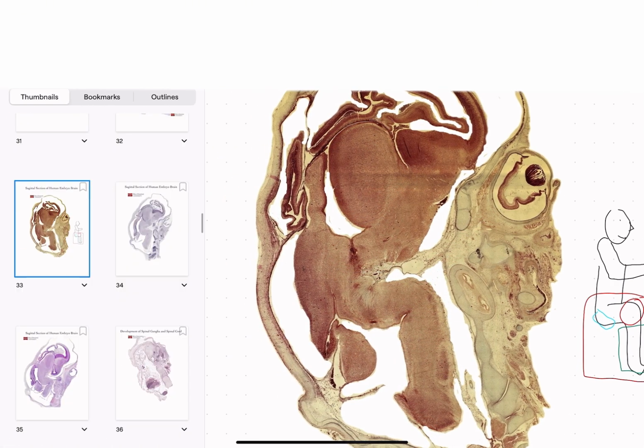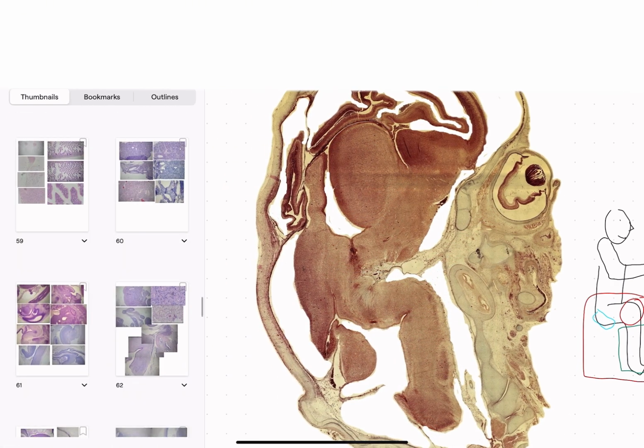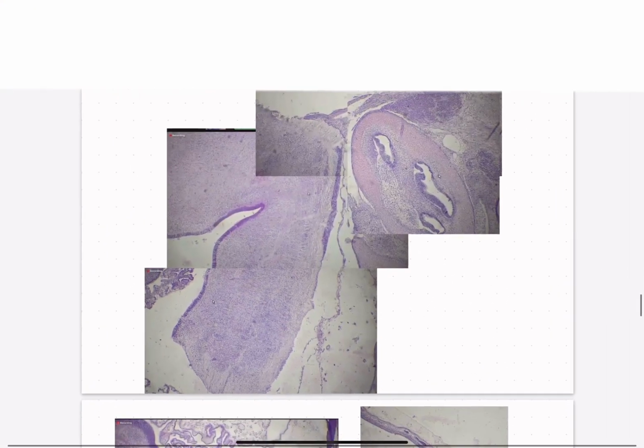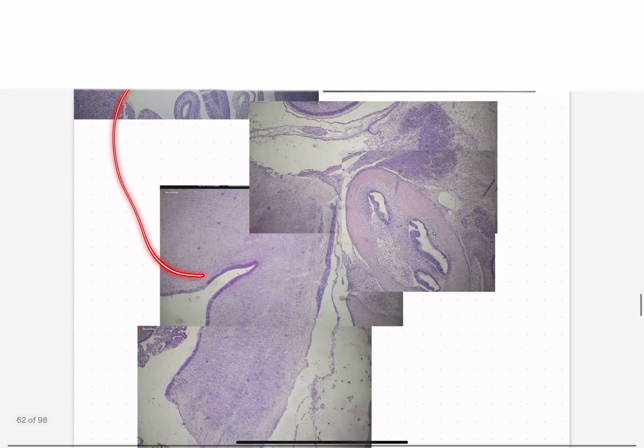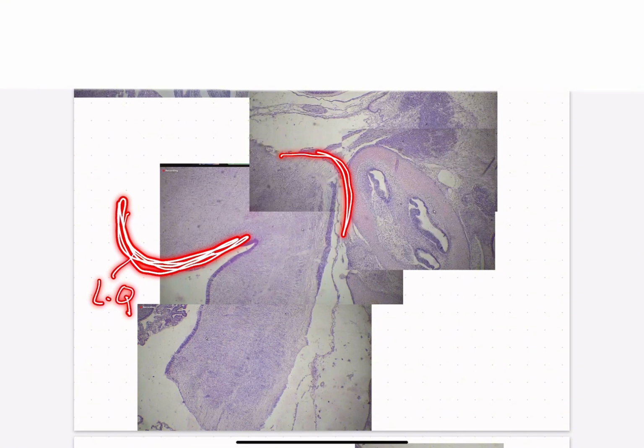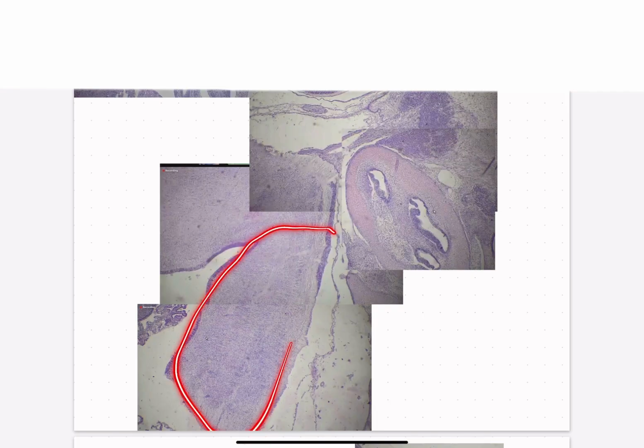Now, if we look at the demo lab slide, this is something that appears almost always. So here, we don't see the remaining parts of the guy, but we can definitely see the thigh here, or the bottom area, which is the lamina quadrigemina, the kneecap here, which is the pons, and below the knees, the feet area, which is the medulla oblongata.